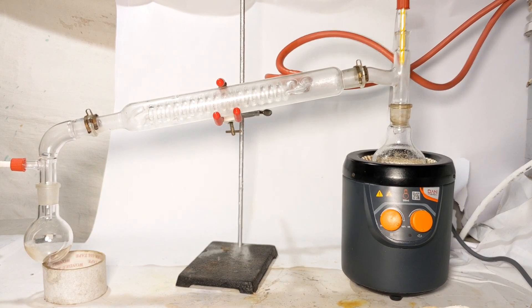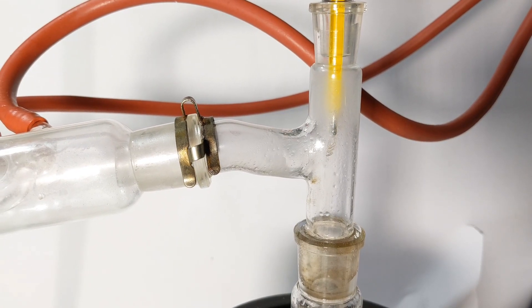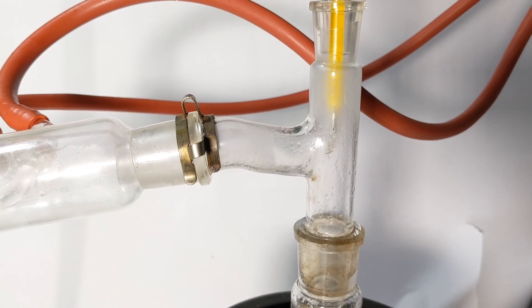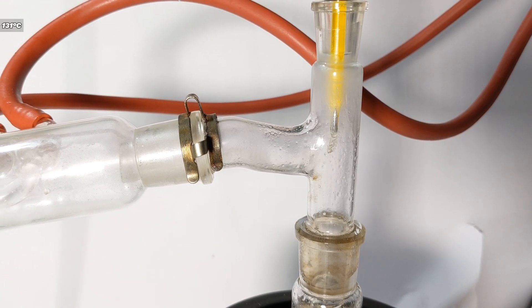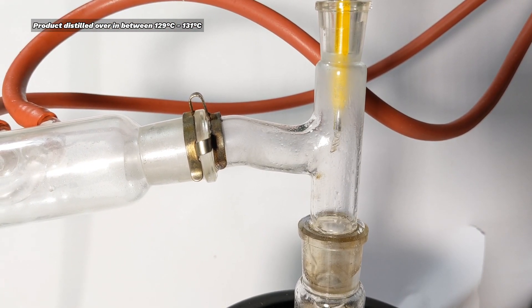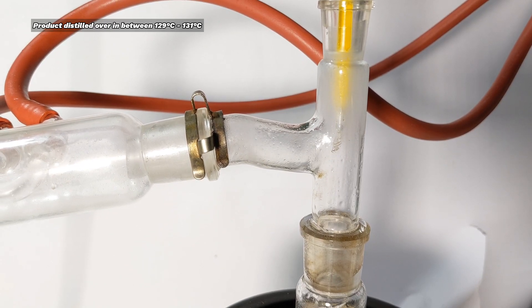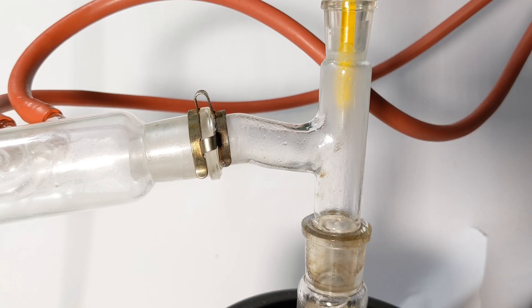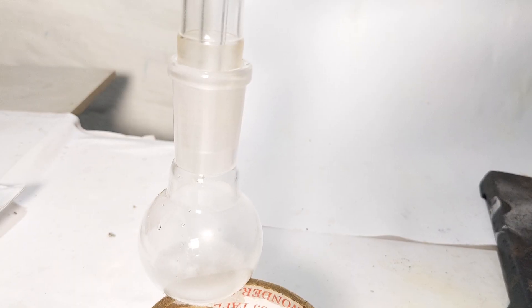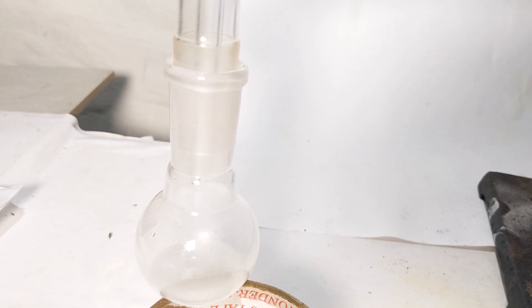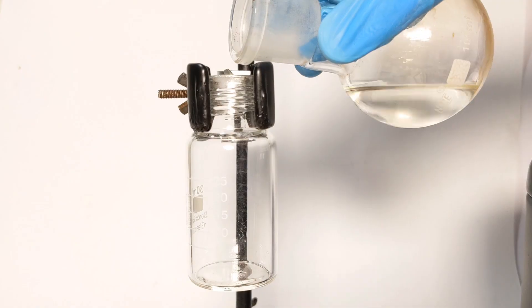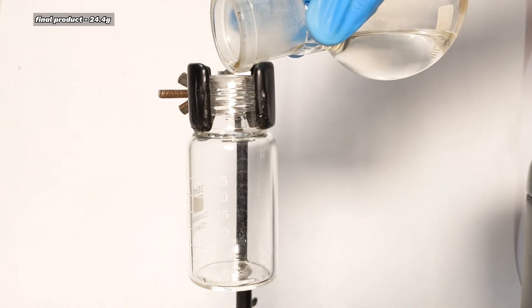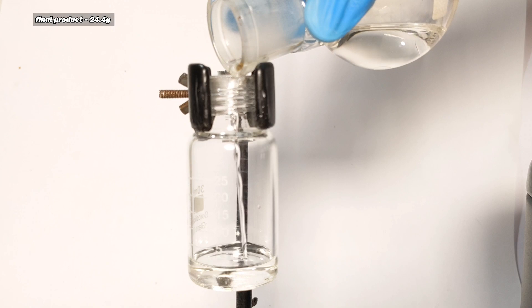When the temperature rose to around 129 degrees C, a new receiving flask was attached at the receiving end and n-butyl iodide was collected in a temperature range of 129 to 131 degrees C. The final yield was 24.4 grams which is roughly 15 ml of the product.